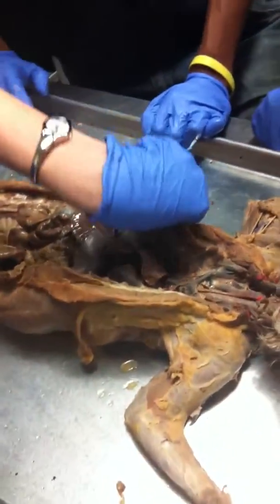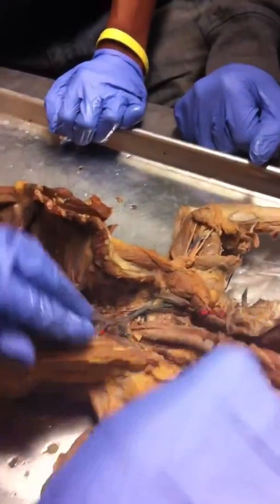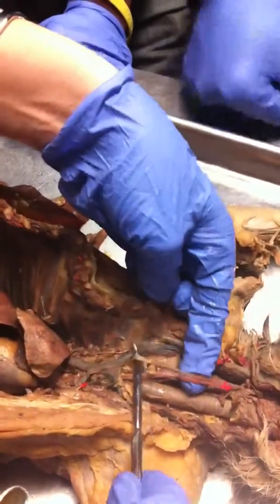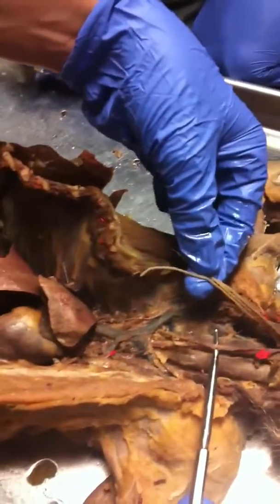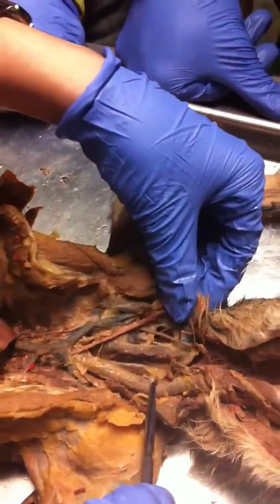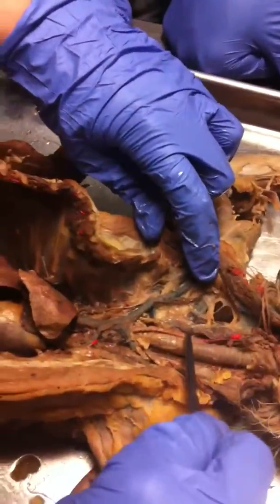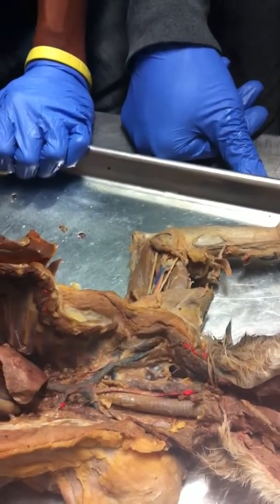And then we have the vagus nerve. It runs alongside this artery here on top. So, does that look like a nerve to you guys? No, that looks like a blood vessel to me. What the heck is that? They choked it, yeah, they did. Right behind it, behind the nose. It was easier on the big cat. I can't see it on this cat.